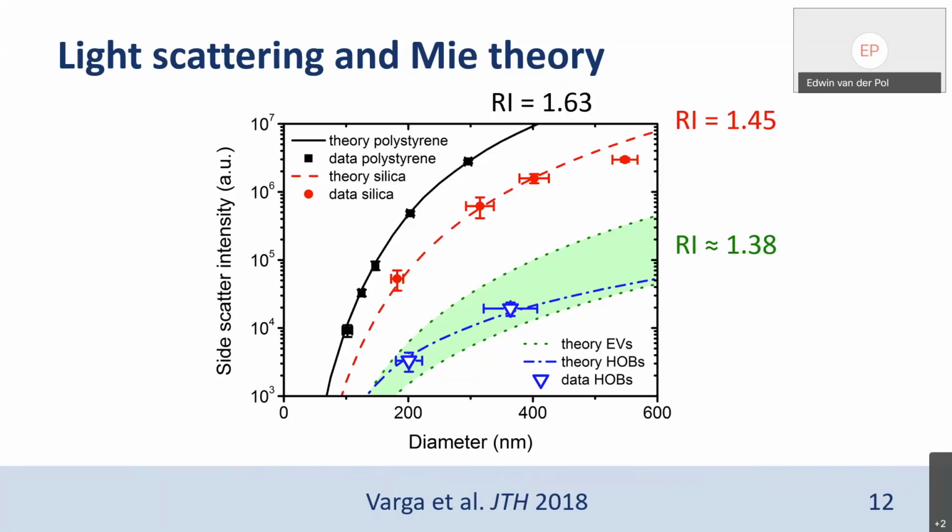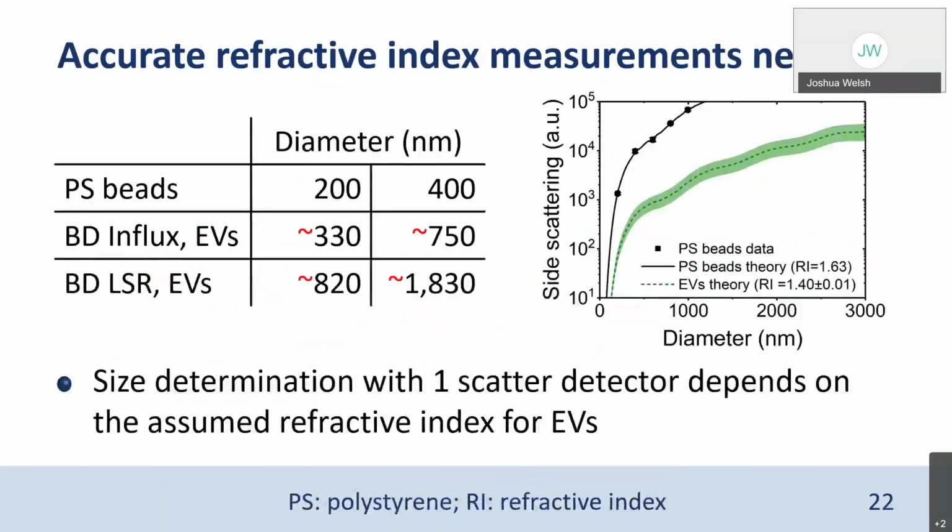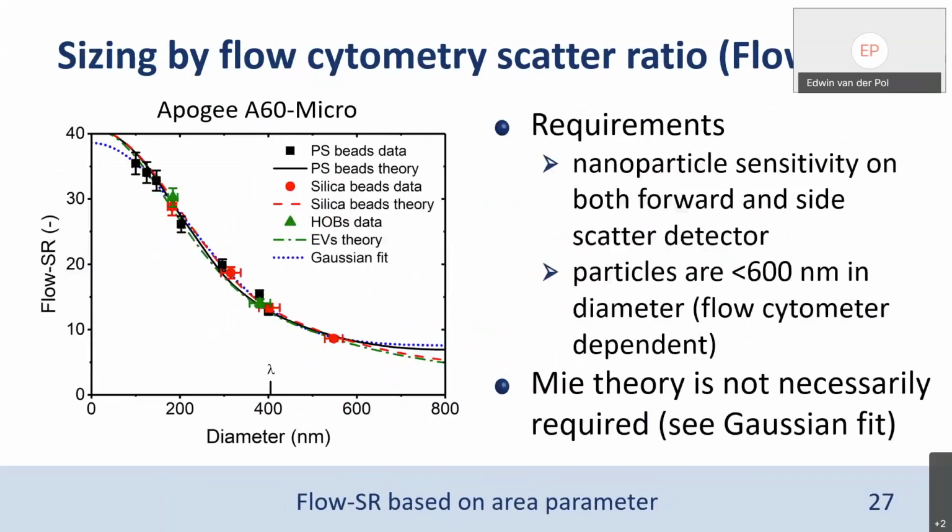Yeah, the questions about the collection angles of the Apogee. What were the questions? So it's asking if the difference between the A50 and the A60 is very large. I think a slide compared one being 4 degrees and the other being 40. Yeah, right. That's this difference, right? Yeah.